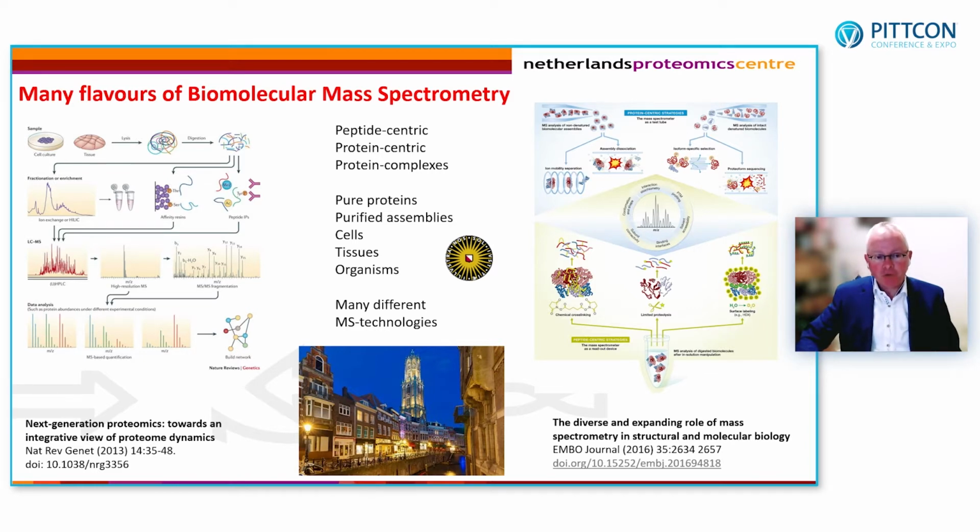And we do this mostly by getting the proteins out of these tissues or lysates, then digest them, and then bring these peptides to the mass spectrometer for identification, quantification, sequencing, etc. Now, I don't want to talk about that, but what I just want to show is that mass spectrometry and the techniques used in mass spectrometry can also go way beyond these proteomics applications.